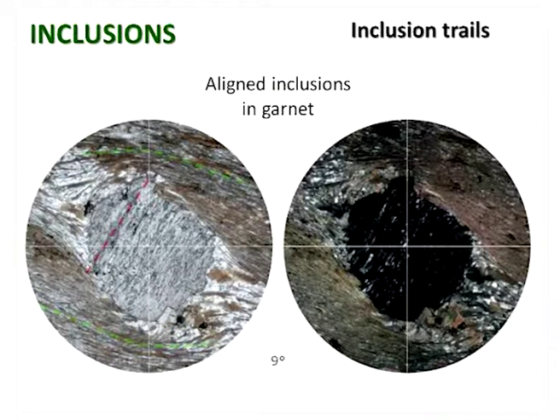So here we've got a rather more extreme example, and I've shown this in both plane and cross-polarized light to emphasize the difference. So, a similar garnet mica schist. It has an external fabric here which I've picked out with the green dashed lines, and again that's sort of bent over the garnet in a rather odd way. And the schist has a banding too, so it has mica-rich portions at the top and bottom here, and then a much more quartz-rich band in the middle.